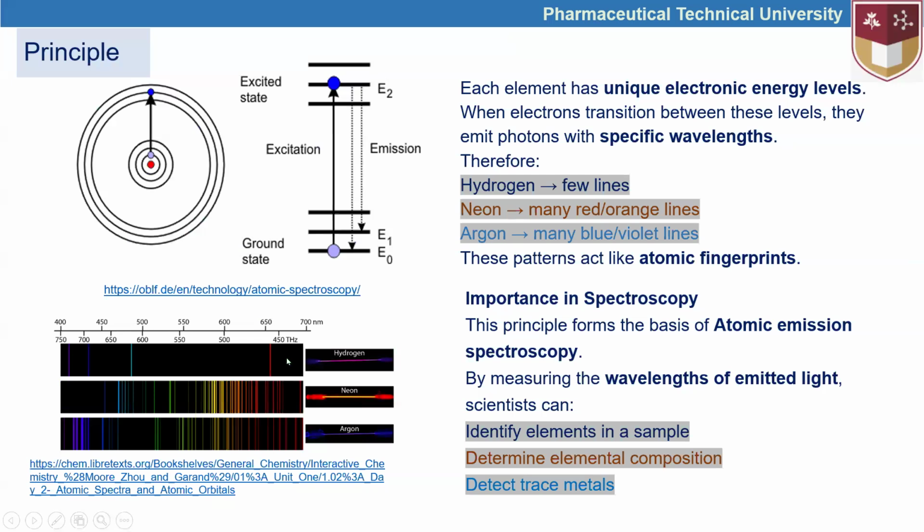These different bands come from the different number of electrons in those atoms, and in the different shells of electrons in those atoms. So the reason why hydrogen or helium have a smaller number of bands is linked with the small number of electrons and small number of electron shells.